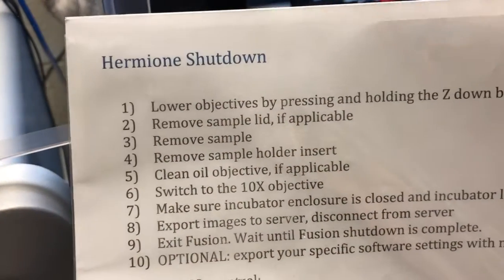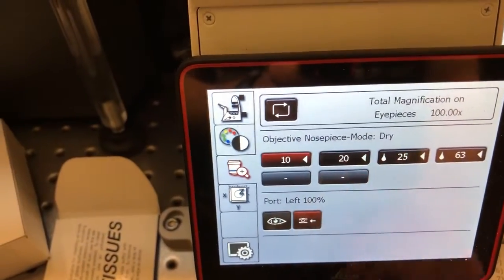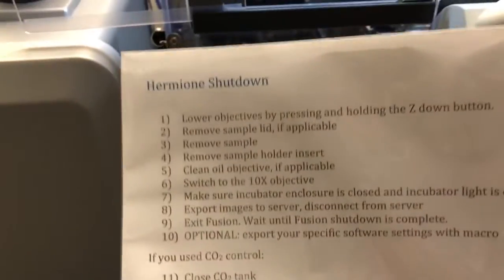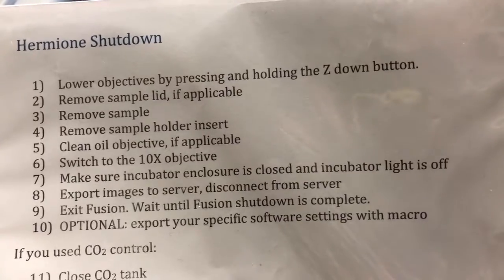The next step is to switch to the 10x objective, which we can do through the touch screen here. Then step seven is to make sure the incubator enclosure is closed and the incubator light is off.